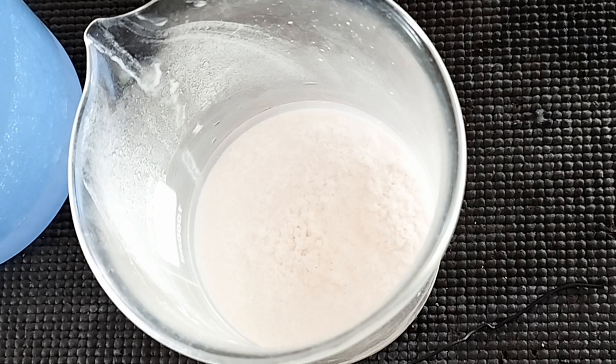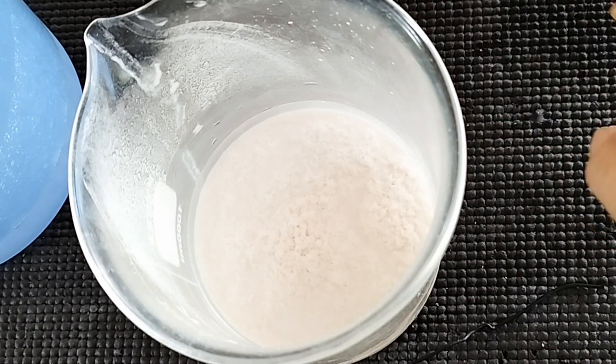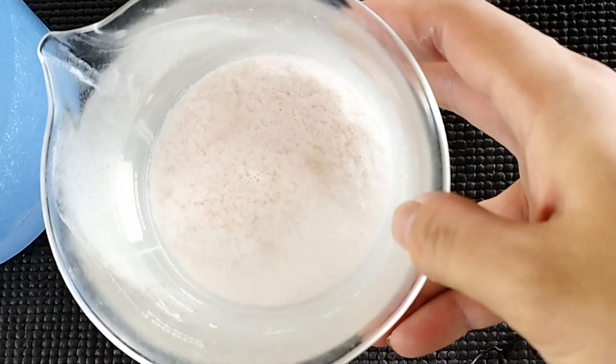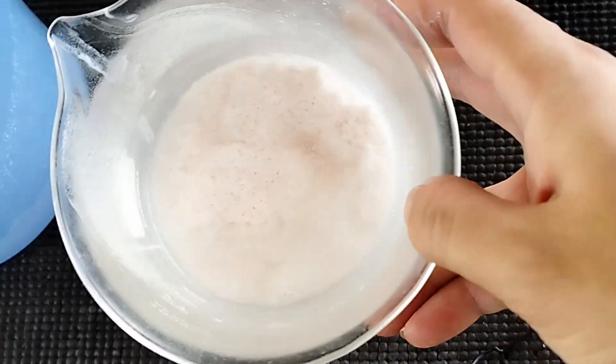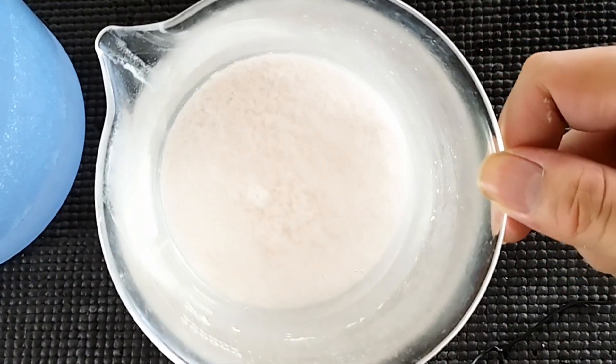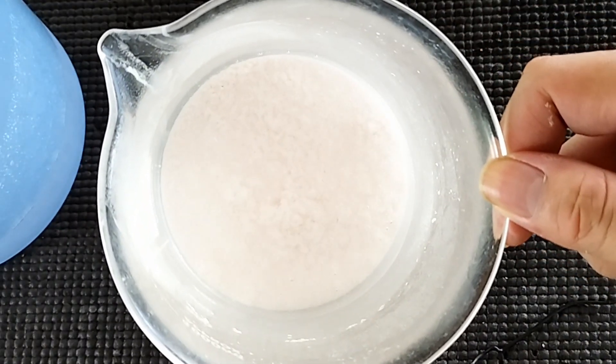As I waited for it to filter I looked back on the flask and noticed this strange formation of fluffy sludge at the bottom. It looks beautiful — I know, I know, sludge looks beautiful — that's where we're at right now.